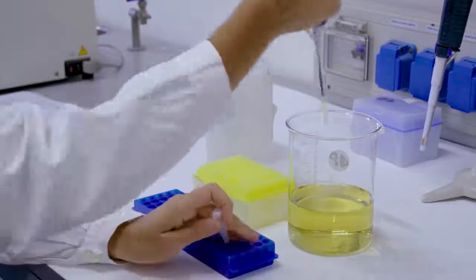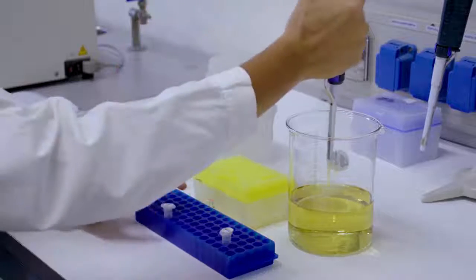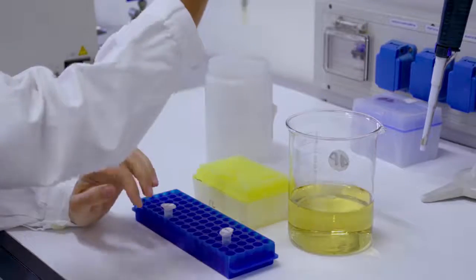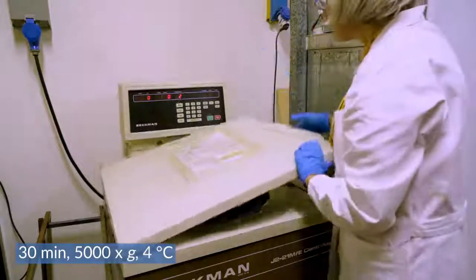At the end of the incubation, incubate the lysate with 1 microgram per milliliter of DNase and RNase for 30 minutes at 37 degrees Celsius, and pellet the cells by centrifugation.